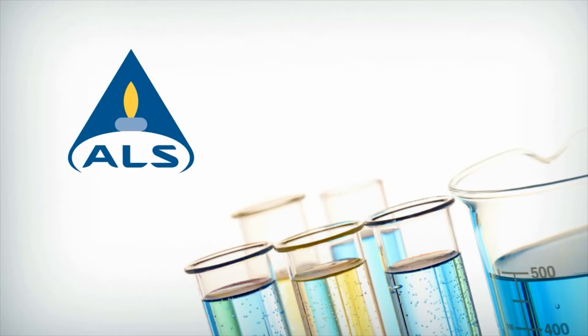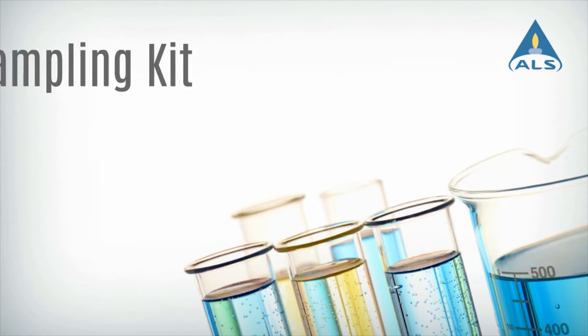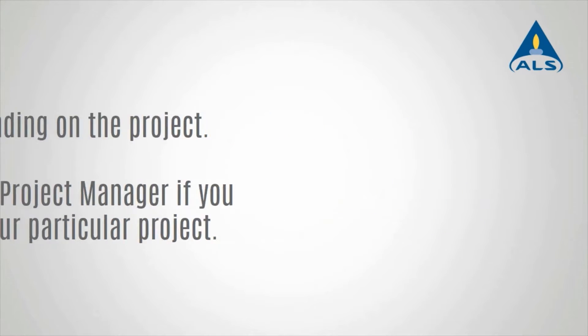ALS has developed a sampling kit designed to simplify field deployment of EPA-325B samples. Use this short video as an overview of the kit and its contents. Sampling supplies may vary depending on the project, so this video is a general guide. Contact your ALS project manager if you have questions about your particular project.